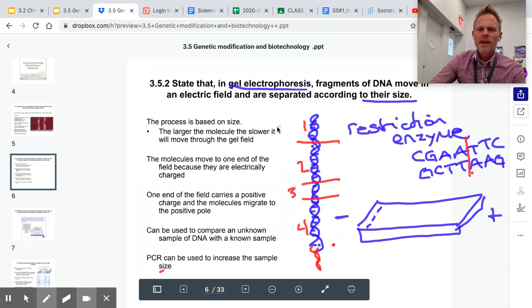Let's pretend that this is Bill's DNA. We found some mystery DNA, but we found Bill, and we said, Bill, we need some of your blood because we think you're the murderer, and we want to see if your DNA matches the DNA at the crime scene. So we put Bill's DNA from the sample into this first well, this first little hole, and then we turn the machine on.